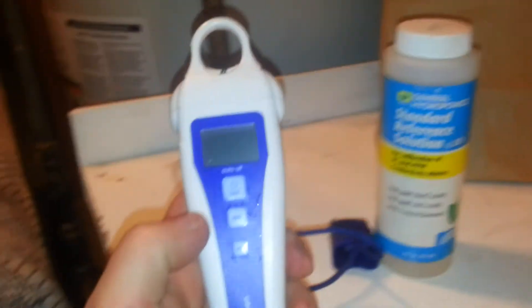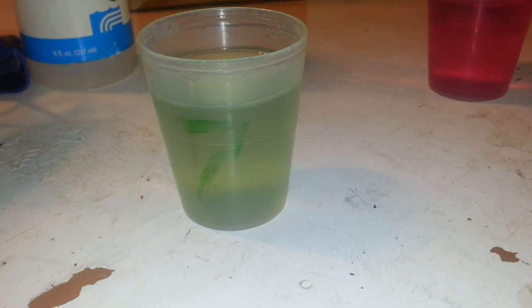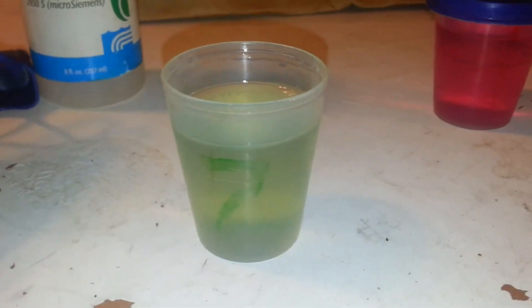With the Bluelab, what we know is if it dries, it dies, so you always have to keep it wet. And you always have to calibrate starting with the 7. You can't calibrate starting with the 4 and then go to the 7 — it'll always error.